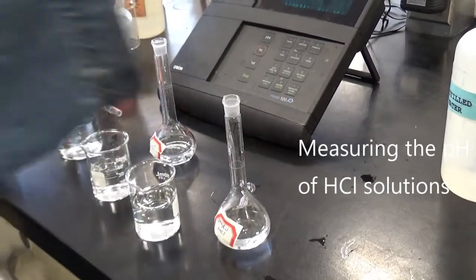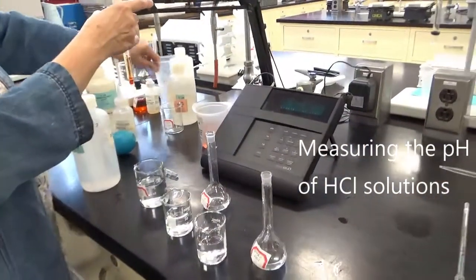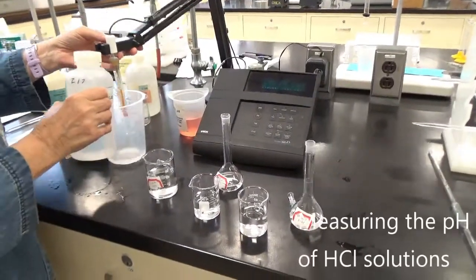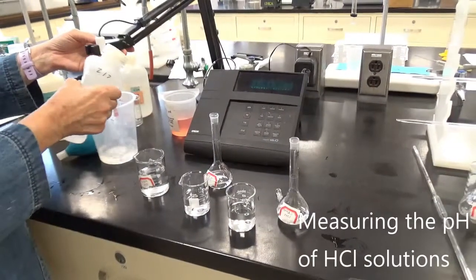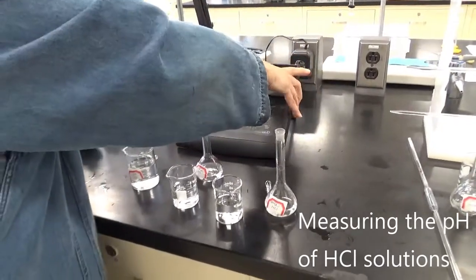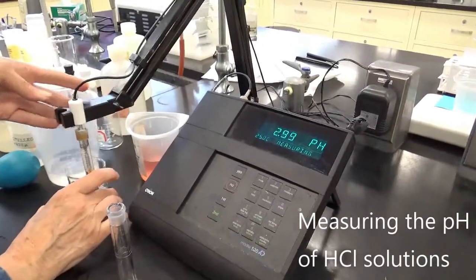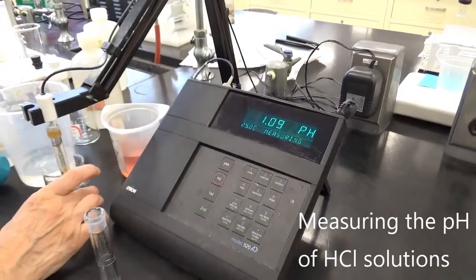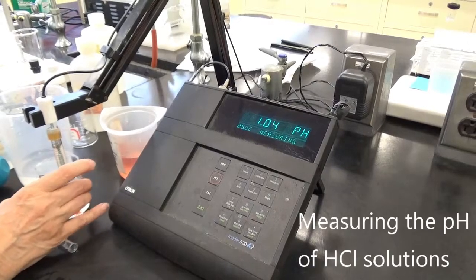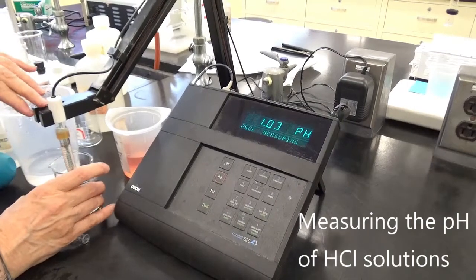So now this is called a pH probe, or a pH electrode, different names for it. And I'm going to rinse it with lots of water. Water is cheap. Distilled water. Okay, so now I'm going to turn it on. I'm going to measure the pH of the 0.1 molar HCl solution. And we want to stir it a little bit, to make sure that you have a stable reading.